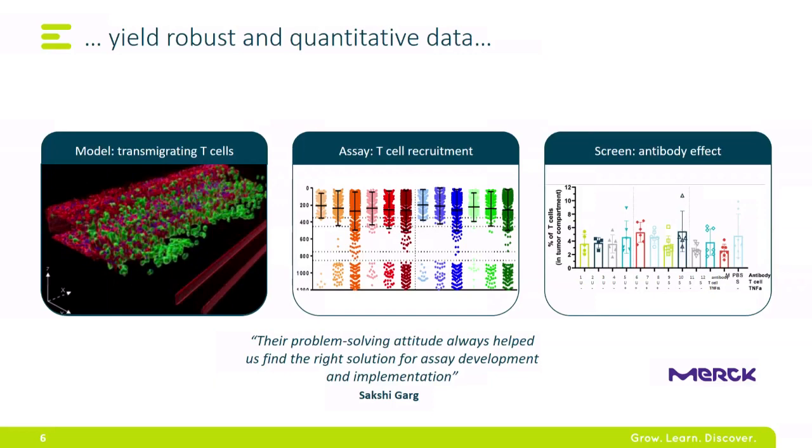meaning that first they adhere to the blood vessel wall, then they crawl over the blood vessel wall, extravasation, and then they migrate in 3D through the extracellular matrix towards the source of that chemokine gradient, or a tumor tissue or another inflamed tissue of interest.